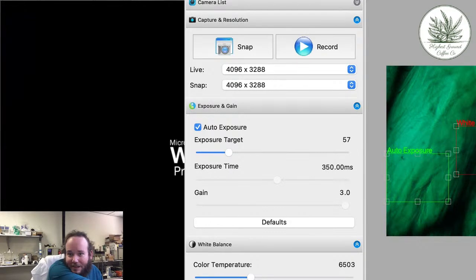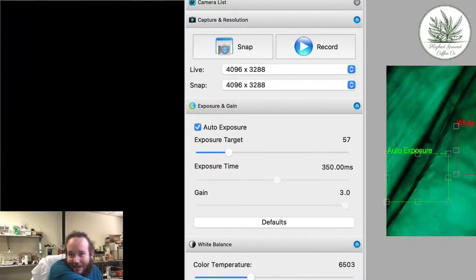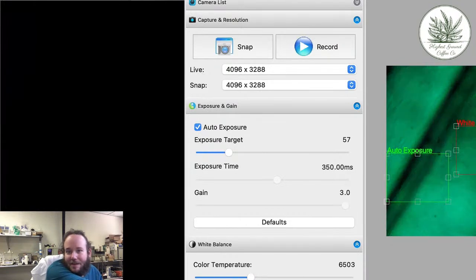Oh, I think I saw it. Yeah, that kind of looks like it. Well, maybe. When we're this close, it's so hard to make out some of these things. The other part of this is we have to fuss around with the depth of field, right?